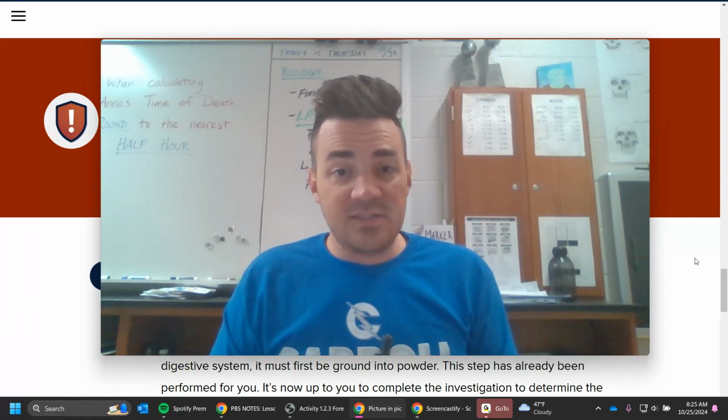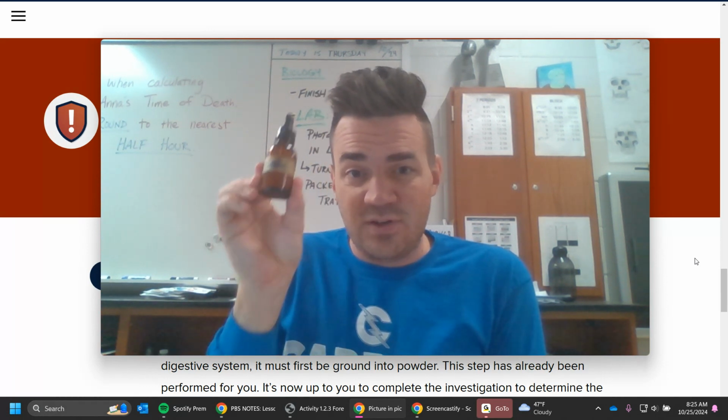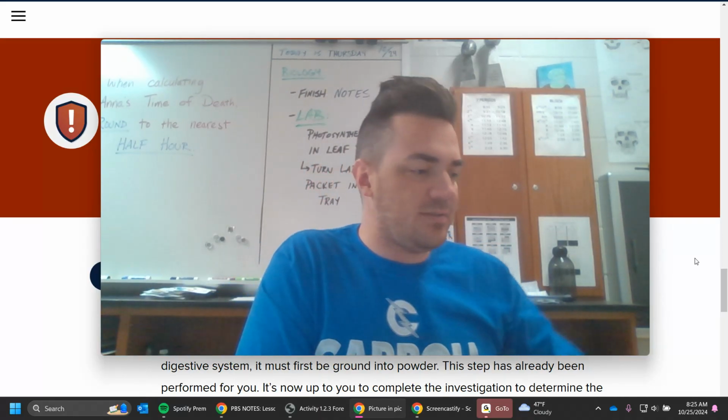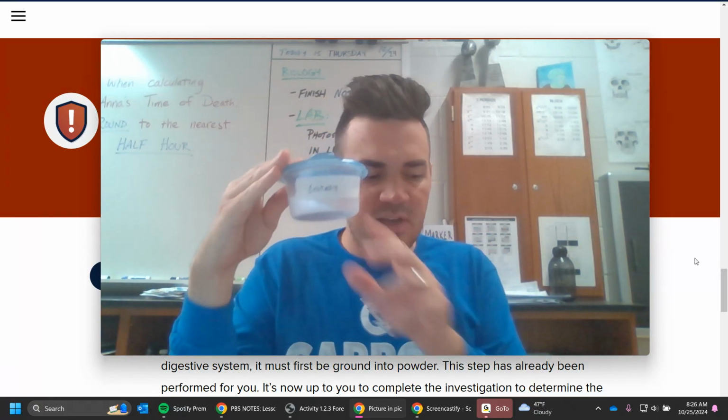And then finally, this is a change to the procedure, so note this. You're not going to be using ferric nitrate. We're going to use iodine instead. So this dark bottle, this is for iodine. That's the other one you're going to be testing with. So not ferric nitrate.